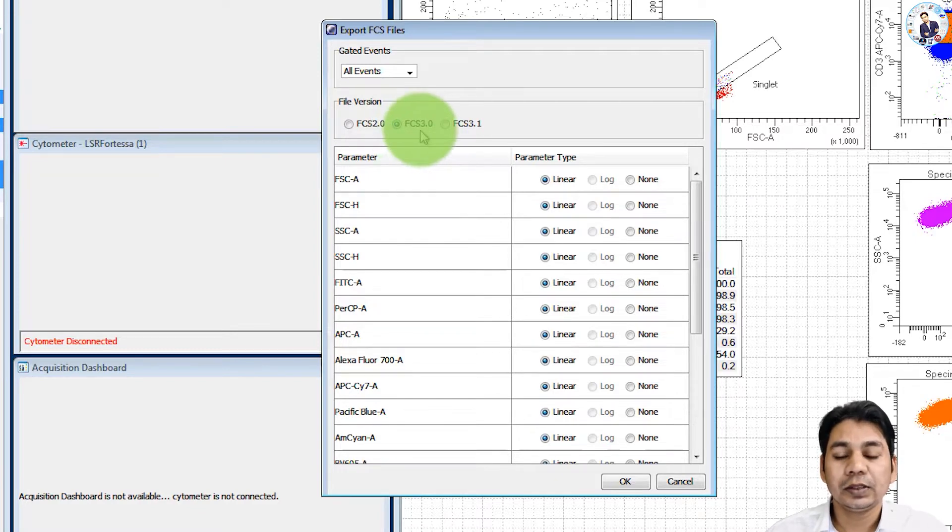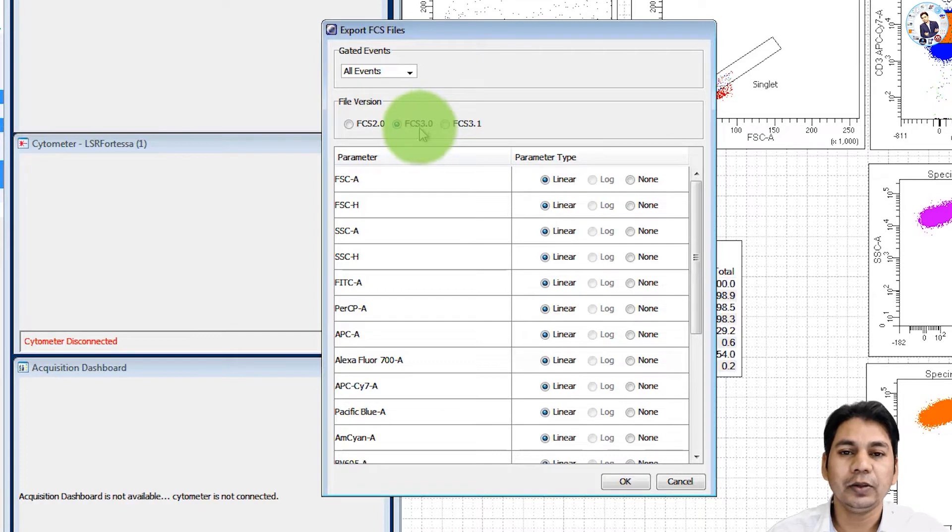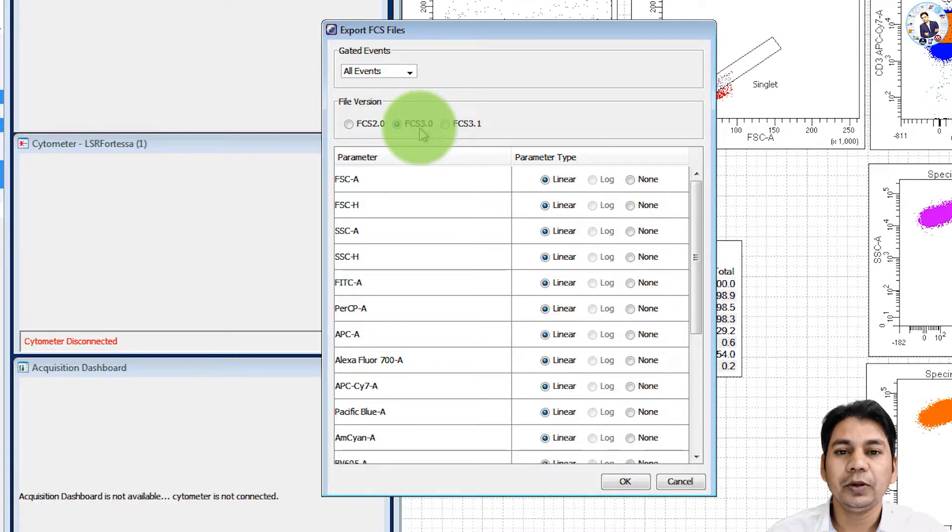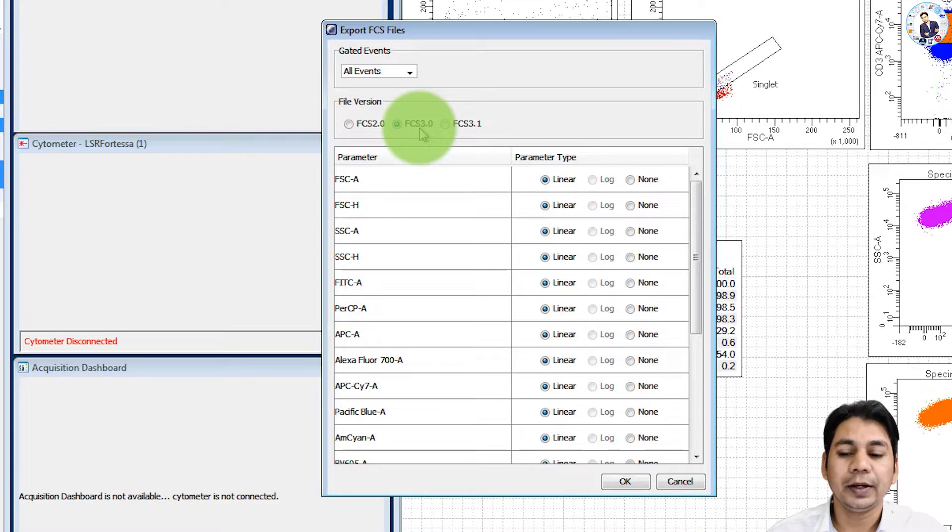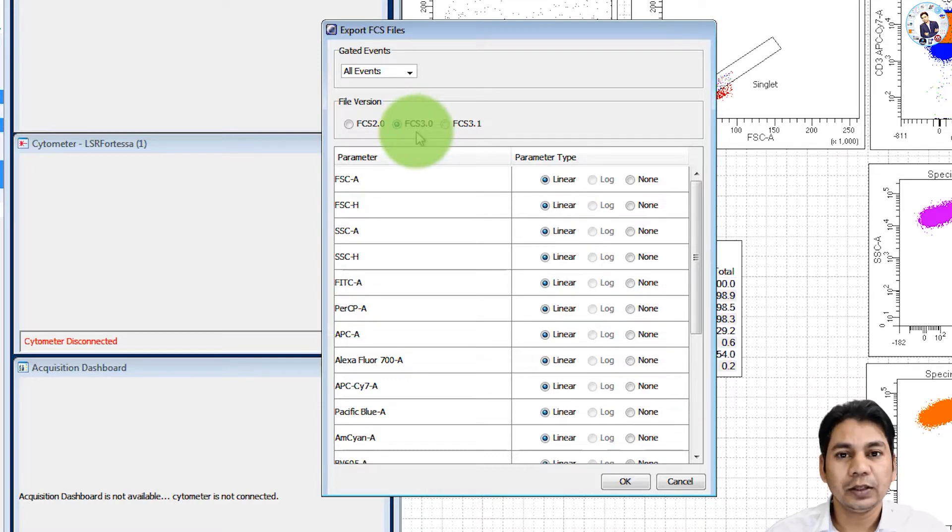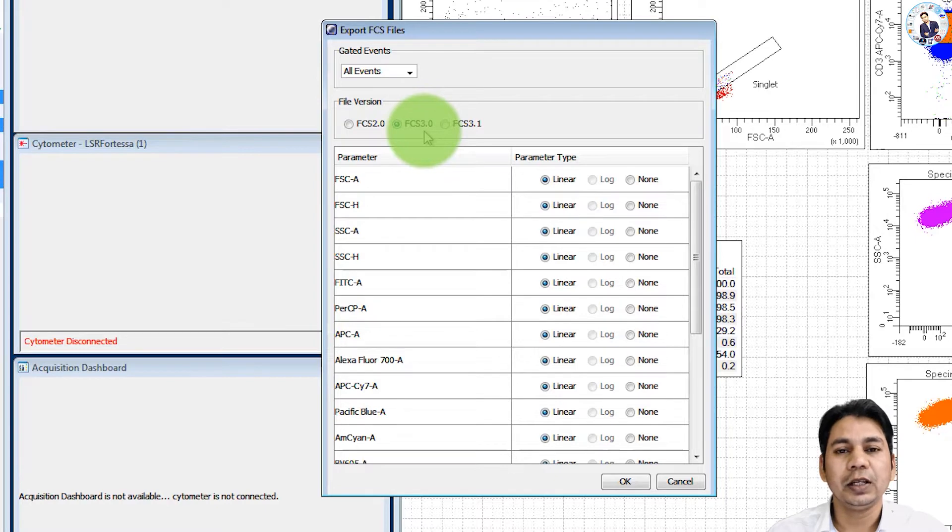In case of CBA experiment, CBA flex set experiment, if you are going to analyze your data using FCAP Array, it is mandatory to export your FCS file in the FCS 3.0 version.